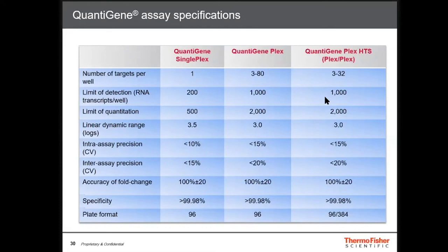So people ask, if I'm using cell lysates, how much do I need? So worst case scenario, if you're using small cells like PBMCs, the maximum input of the lysate is going to be the equivalent of 80,000 cells. If you're using more typical larger cells, cell lines, you might be using 30,000 or less per well. And again, directly lysed and then into the assay. These lysates, the tissue homogenates that you make in a different buffer, can be made and they can be frozen. They can be frozen and thawed multiple times. So you can collect samples, freeze them, and then run them when you're ready.